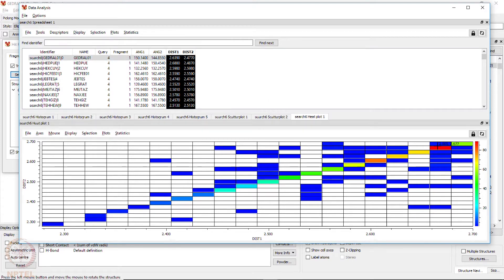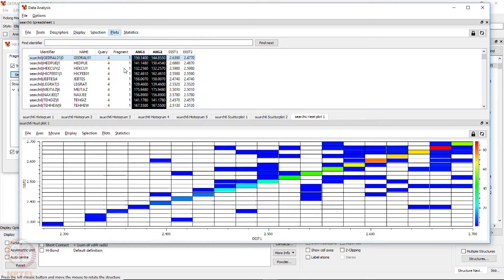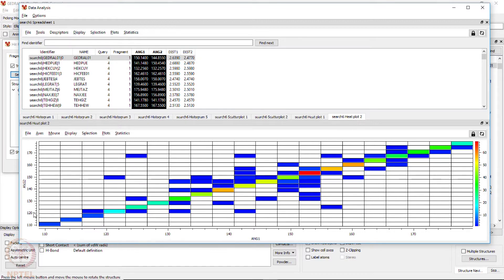This indicates that the maximum occurs very close to the sum of the van der Waals radii. The same analysis can be done using the two angles. Using the two angles without any cone correction, the heat plot shows that the maximum probability falls somewhere between 152° and 154° in both directions. There is also a notable population close to 140°.